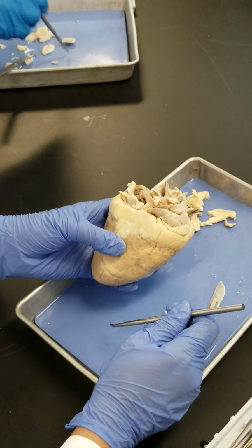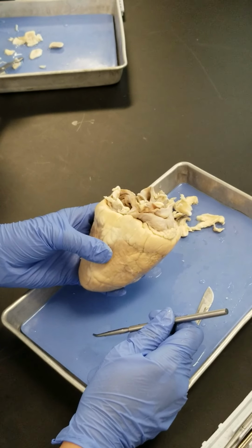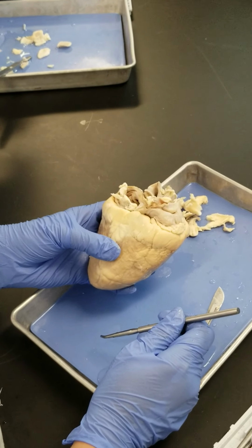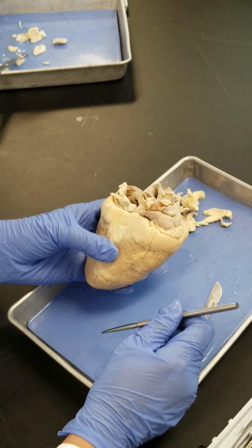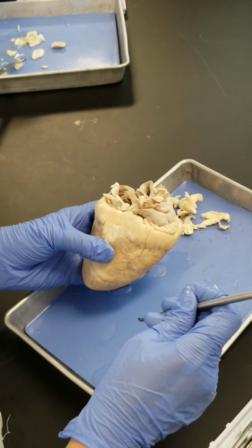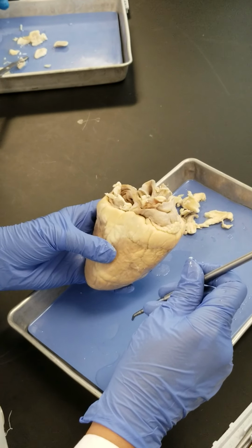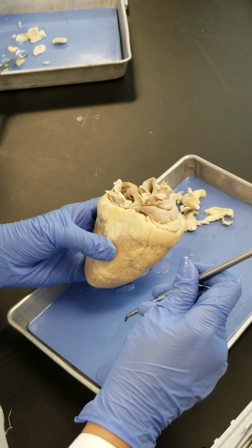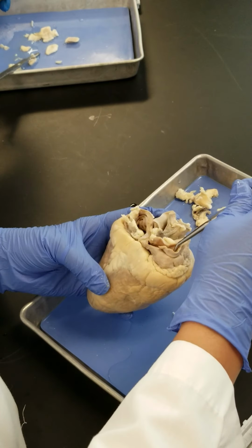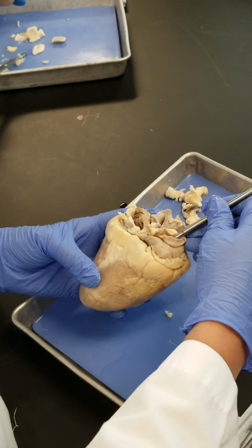Vena cava. Which vena cava? Superior and inferior. Both of them? Just the superior? I thought both of them. You don't see the inferior. Both go. Here, use your knowledge first, right? To the right atrium, which veins are going? Superior and inferior vena cava. When you have knowledge, don't doubt it. Okay? Superior and inferior, both of them are going into the right atrium, right?